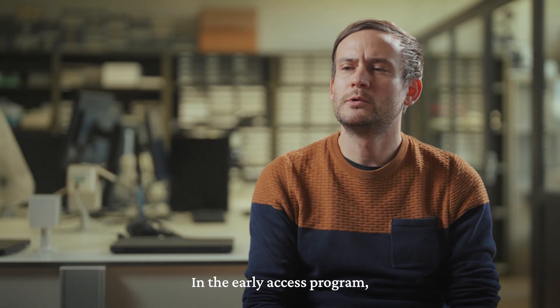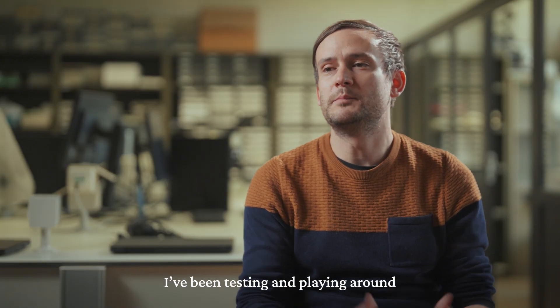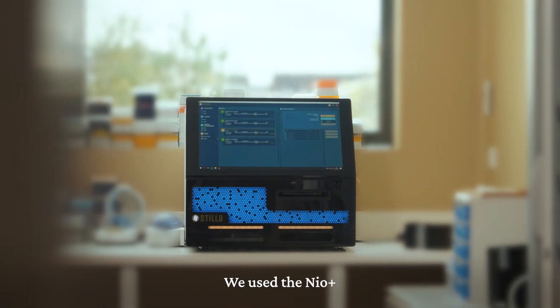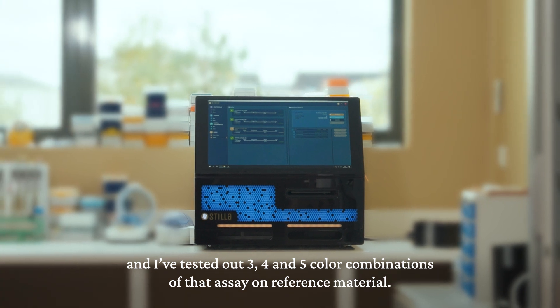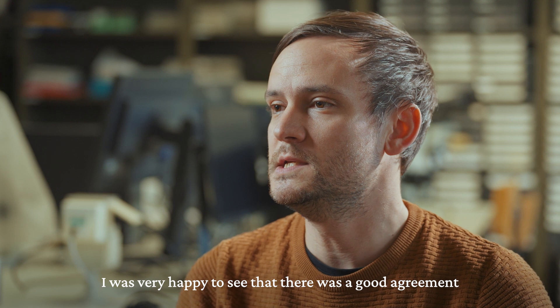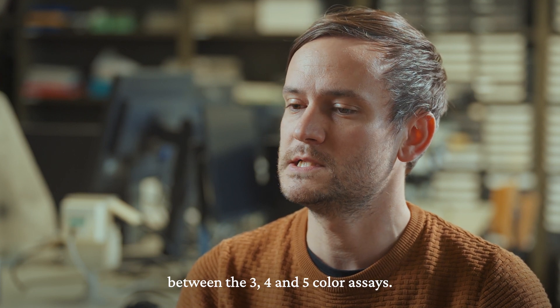In the early access program I've been testing and playing around with the HIV rainbow DNA assays we've developed over the last year. We used the Nio+ and I've tested out three, four, and five color combinations of that assay on reference material, and was very happy to see that there is a good agreement between the three, four, and five color assays.